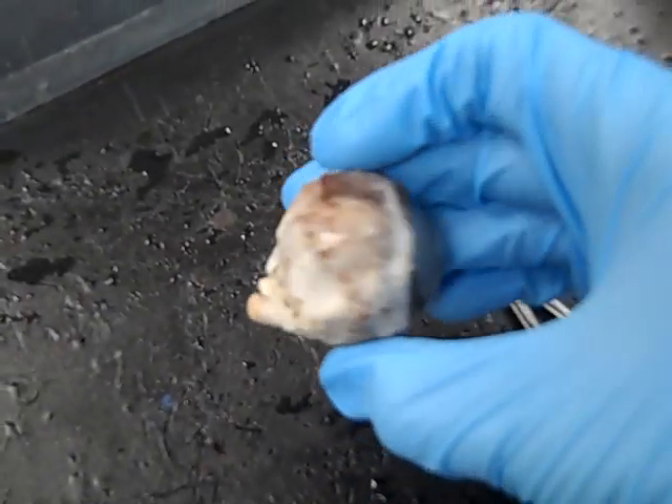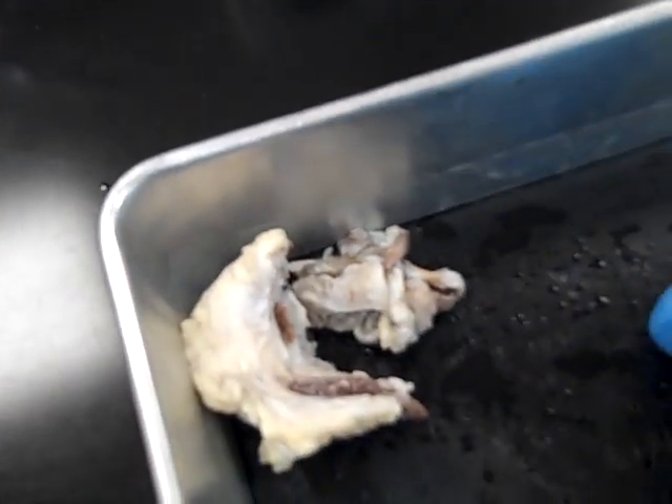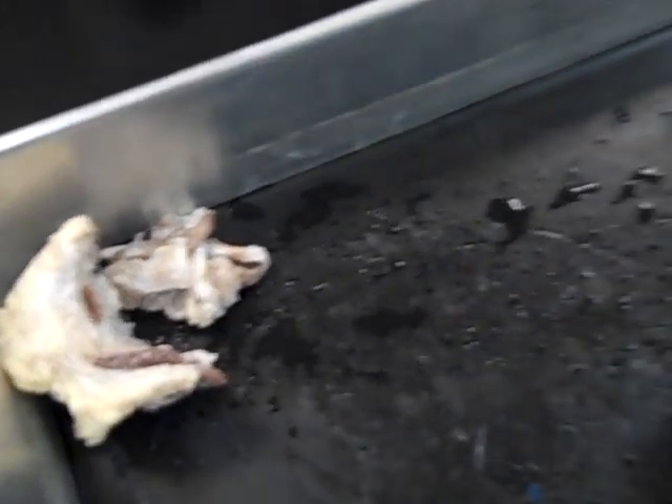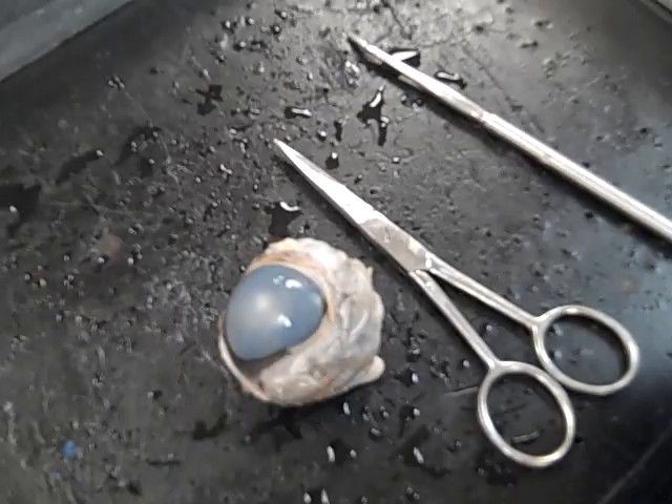You'll notice the eyeball I have here is nice and clean and smooth. That's because I removed all of the connective tissue, fatty tissue, and muscle before I got started here to save us a little bit of time. If you're doing this dissection in lab, you're probably going to have to remove a little tissue before you begin.